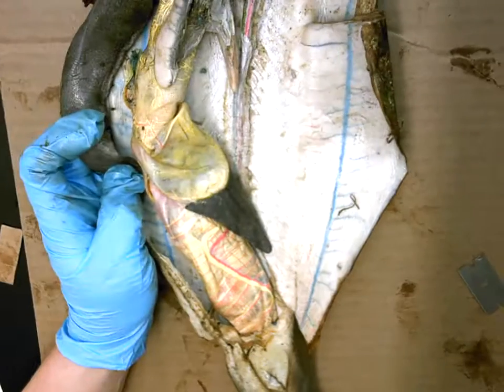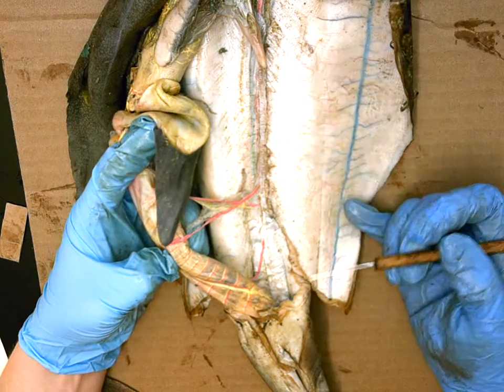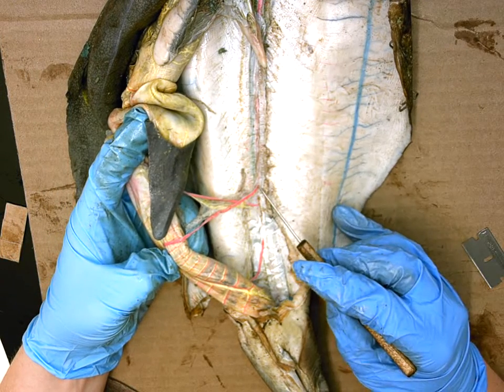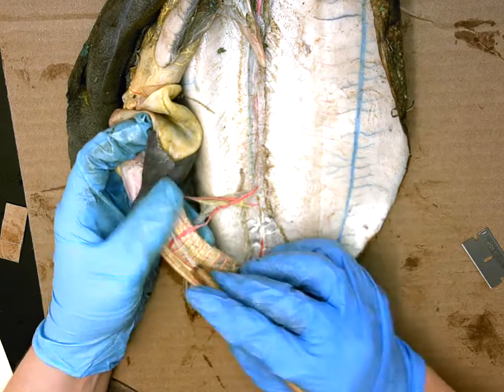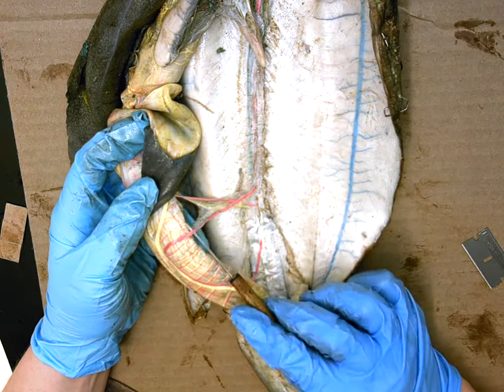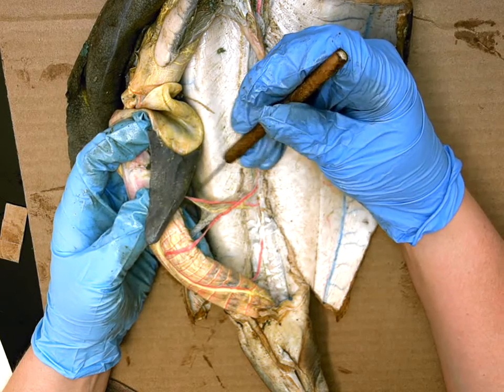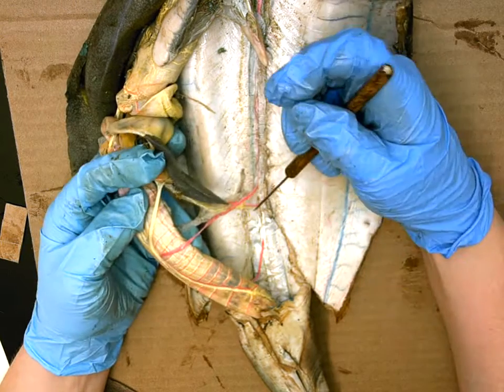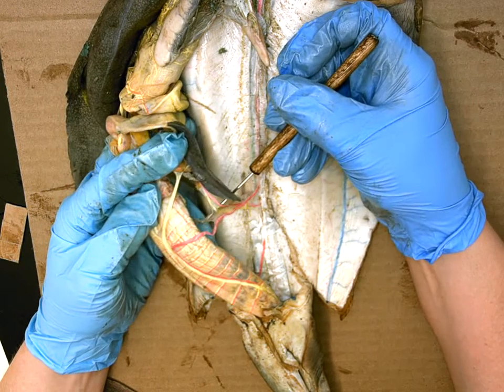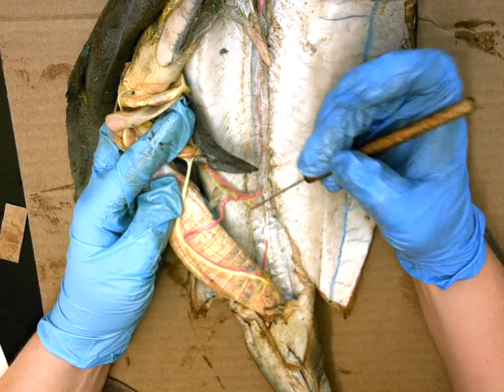Moving to the posterior region of the shark, there is another branch of arteries. The first one goes backward to the lower half of the intestine and is called the posterior intestinal artery. There is also an artery that shoots forward and up to the triangular-shaped spleen; this one is called the gastrosplenic artery.